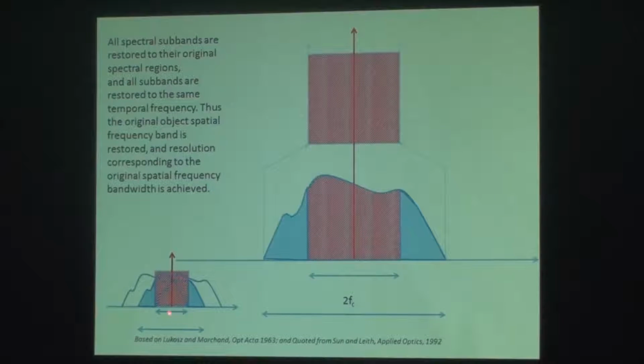The problem now is that these frequencies are completely overlapping, because the objective is collecting in the same location, but you have the extra frequencies, and they are at spatially different locations. So you need to figure out how to put the line you see here and the line you see here back in here and back in there. That calculation is done in the Fourier space.